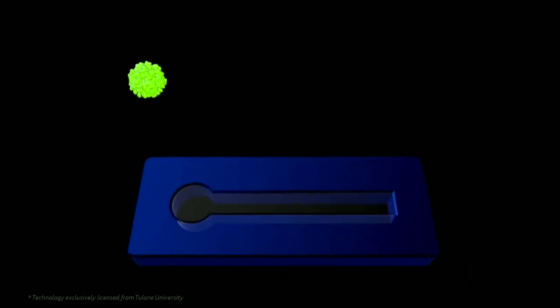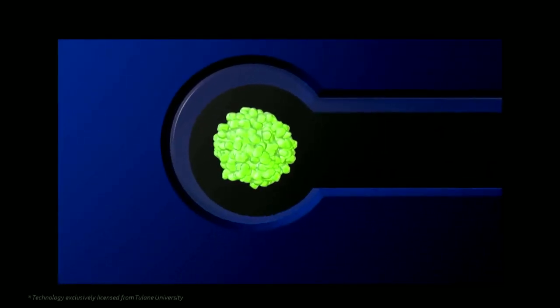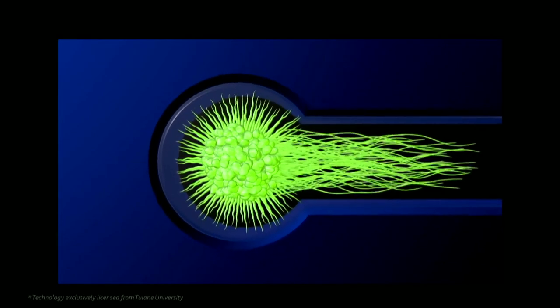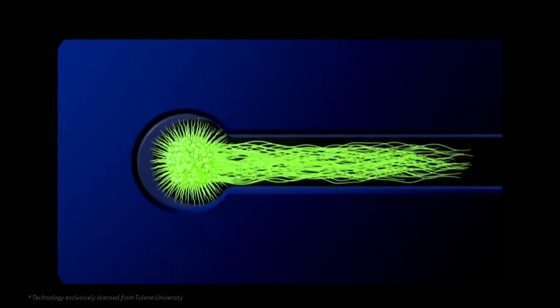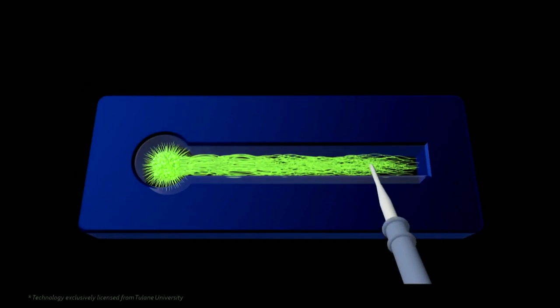Now, there's a lot of spheroid work that's done in a lot of different areas, but then we take that and put it onto the NerveSim construct. Over the course of, again, depending on the cell type, it could be up to 4 weeks, sometimes even longer, sometimes shorter. We then can grow and really guide how those axons grow down this channel, and now over electrodes as well, to be able to do this population level electrophysiology.